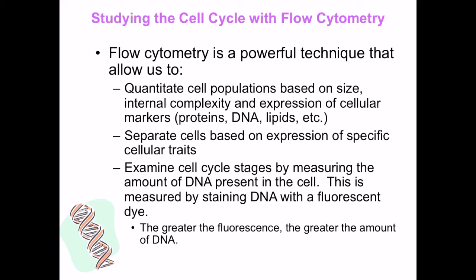In a sense, it is very similar to fluorescent microscopy. If you have a reagent that can fluoresce and be used to identify the molecule, you can use it in flow cytometry. Now, because of the complexity of the instrument, it also allows us to separate cells.